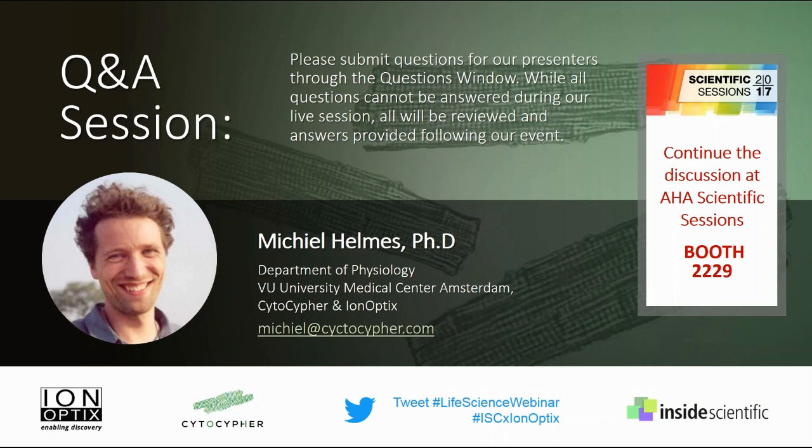Very good. Okay, another question, this one comes from Mayal. Does the reliability of data depend on the force of the contraction? And if so, is there a threshold for this from your experience? Hard question to answer, because of course, if you measure segment shortening, it's always a proxy of the actual force that is being developed. It doesn't necessarily translate. I mean, it's largely determined by the duration of your calcium transient.